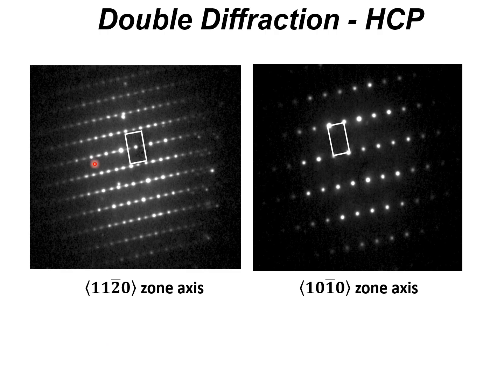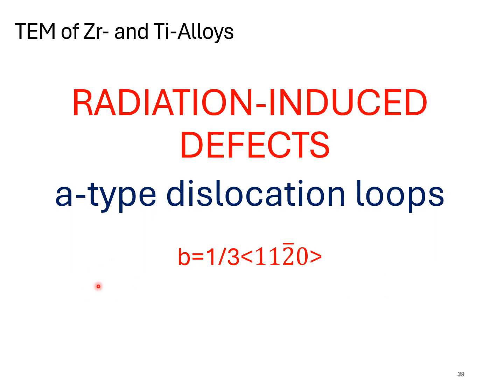Double diffraction effects. The first and easiest way to know that you have double diffraction is looking at the Kikuchi lines. Basically, we'd only get Kikuchi lines corresponding with these wider separation of the diffracted spots, and you don't see any Kikuchi lines with the shorter ones. That would make a lot more sense if you saw the other lectures I'd given.